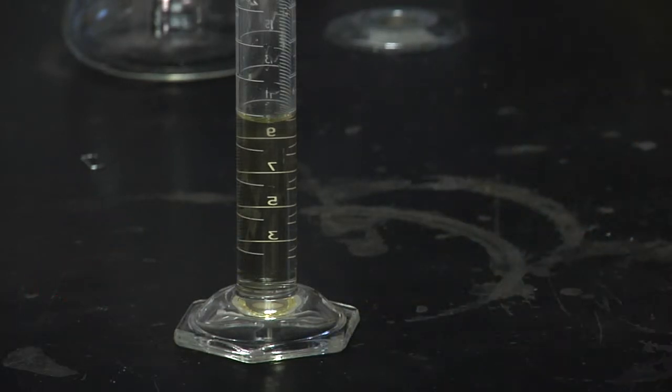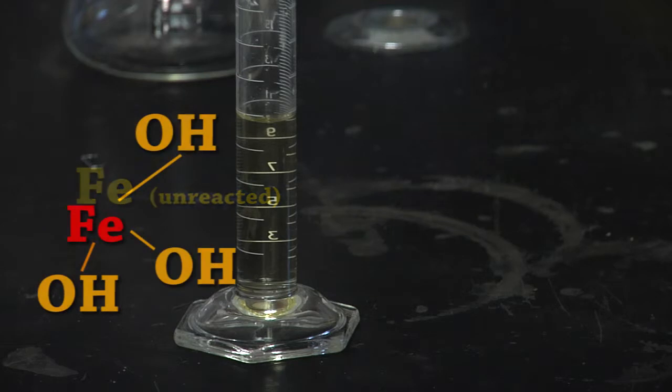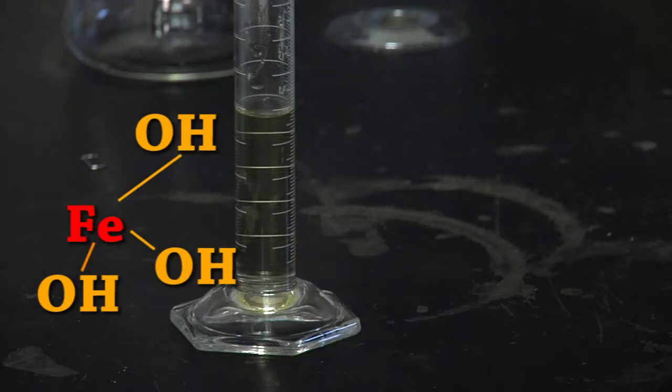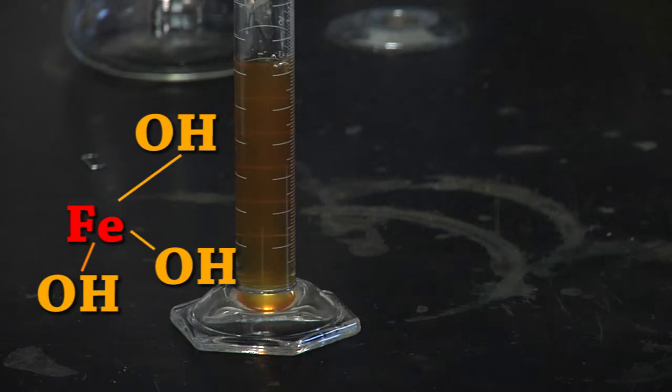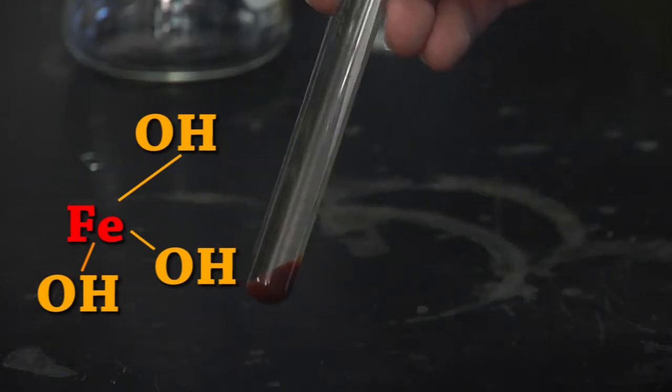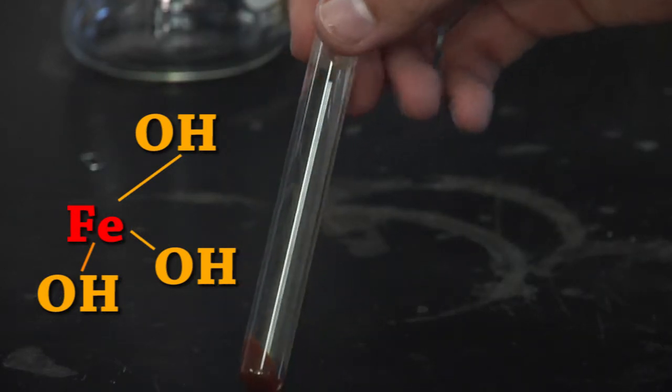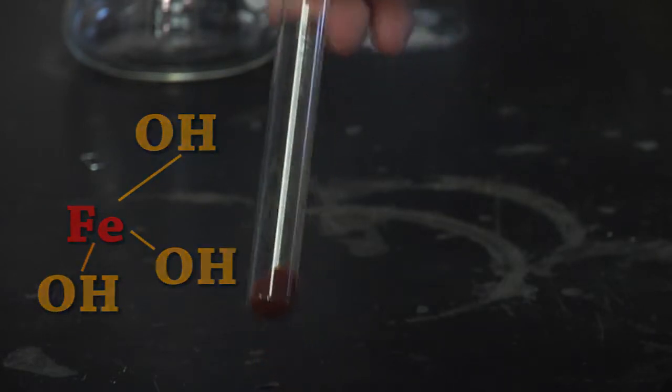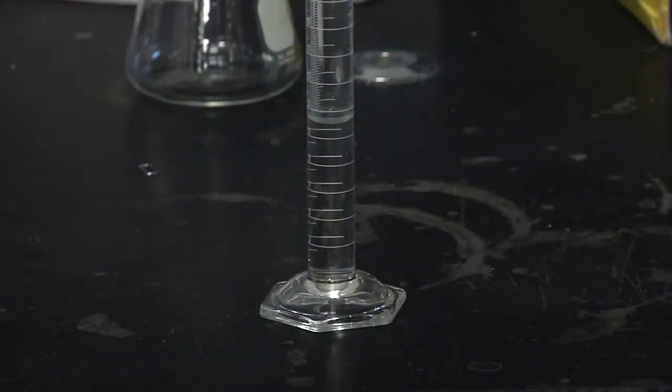Okay, so now that we have excess iron in solution, we need to remove that with the hydroxide. We are going to go ahead and add the sodium hydroxide, and you will immediately see a reaction. After centrifugation, you should have something that looks kind of like this.